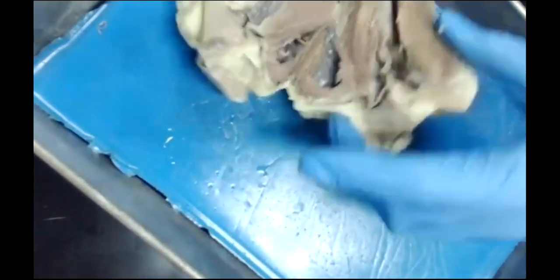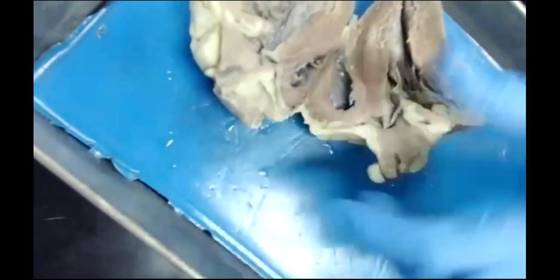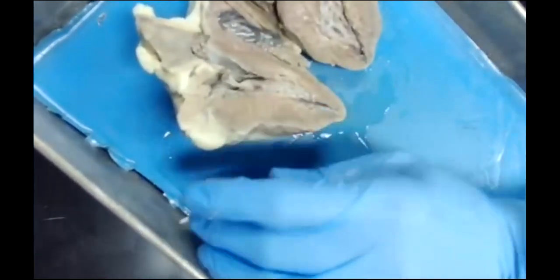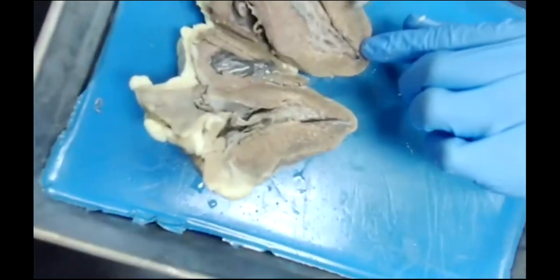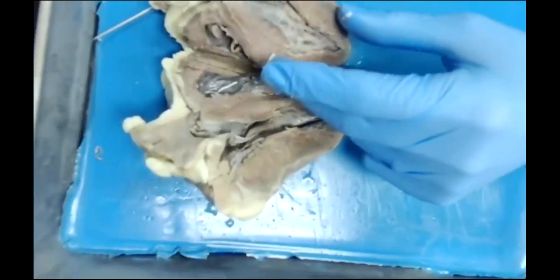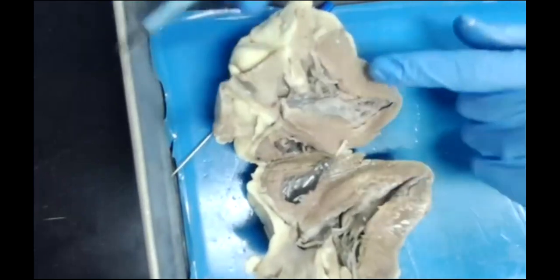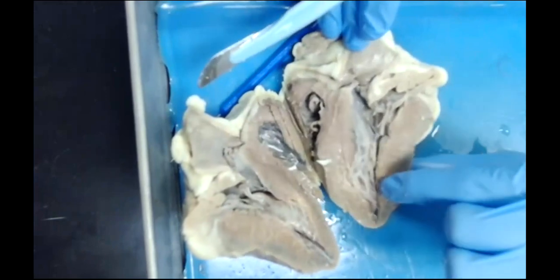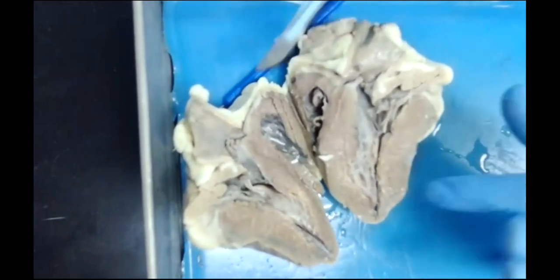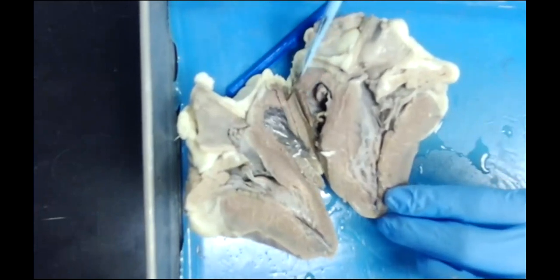Okay, that was reasonably successful. About as good as I could have hoped for, to be honest. So what we've done is we basically have separated our left side of the heart pretty well. We can tell it's the left side of the heart because we have a ton of mass here. Okay, wait, hold on. Where do I need to be? Okay, there we go. So we can see all of this muscle down here. So this tells us that we are in the wall of the left side of the heart. So here we can see the wall of the right. Notice how much thinner that muscular wall is.